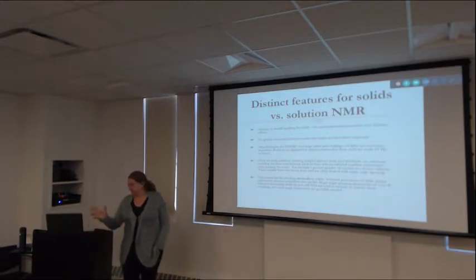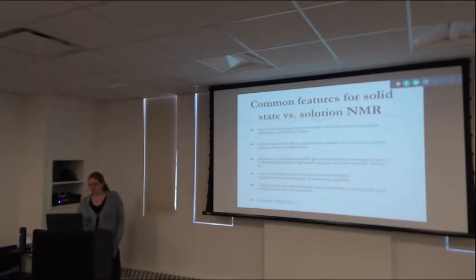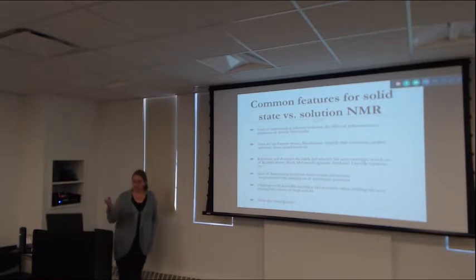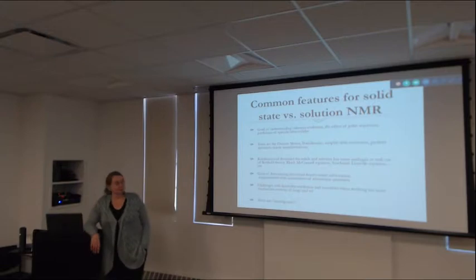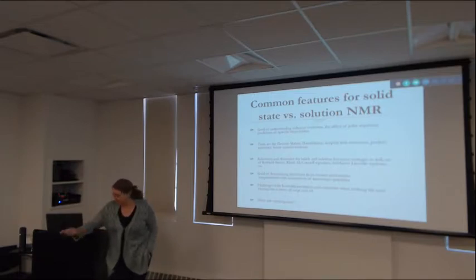So that's a big difference, solids versus solution, and it drives all the differences and choices of hardware, those strong coupling networks. But as we said at the very beginning, while we were having these projection problems, there's so much in common between solution and solid. So I just highlighted the differences, but remember at the beginning I said, and what Art's been talking about for solution NMR, we could state in the biggest terms what's our goal. Our goal is to understand coherent evolution, the effects of pulse sequences. Somebody tells you what your starting magnetization is, what the Hamiltonian is. The skill you should leave this course with is you could predict the future. And you use tools like the density matrix.